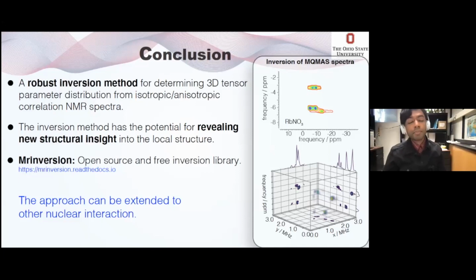that the amplitudes of these line shapes are dependent on crystalline orientation, and the kernel that we are using assumes an ideal line shape. So when you use an ideal line shape and you have a distorted line shape in experiment, you get these unwanted intensities.